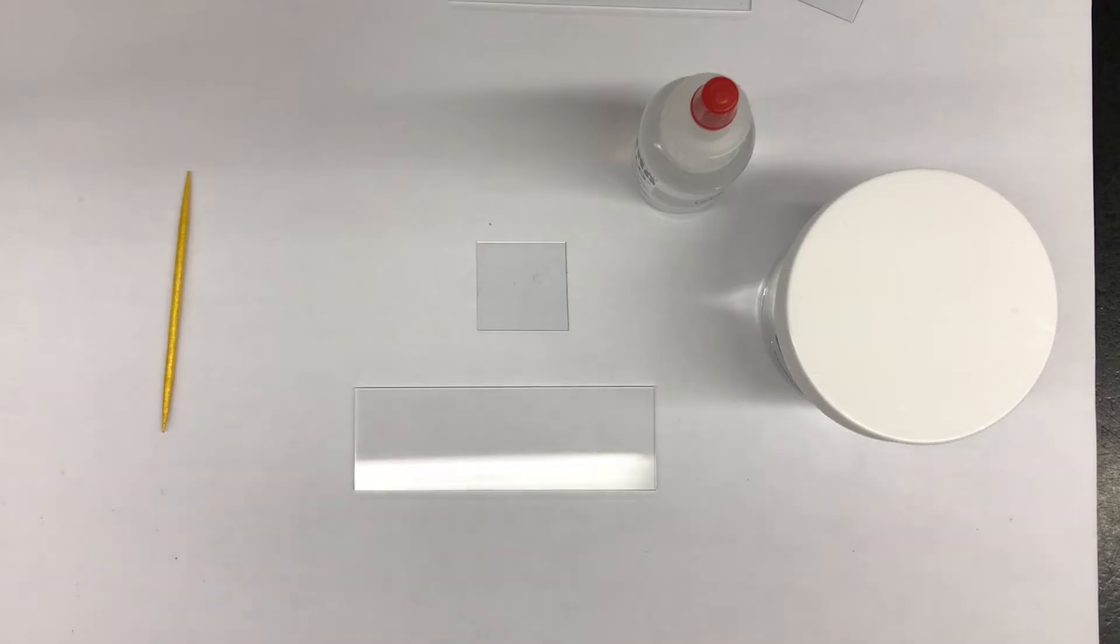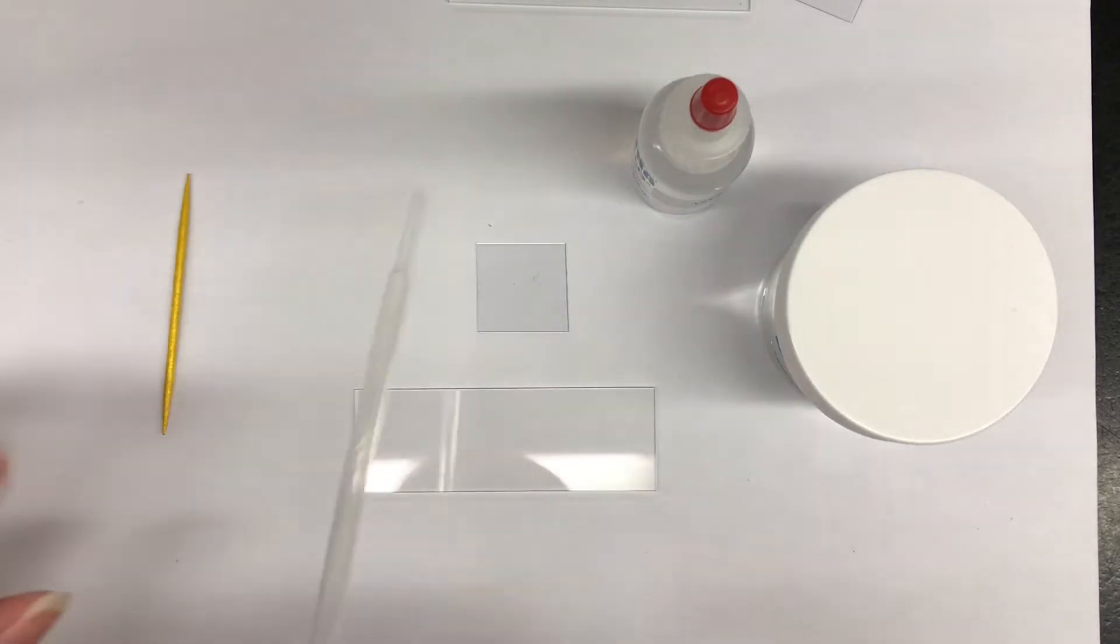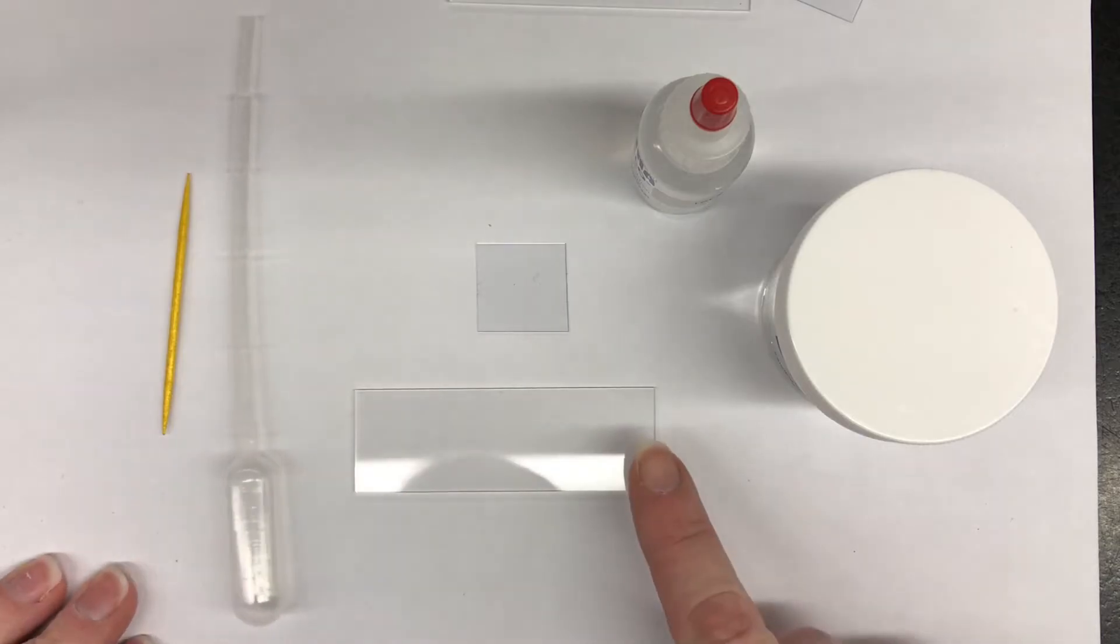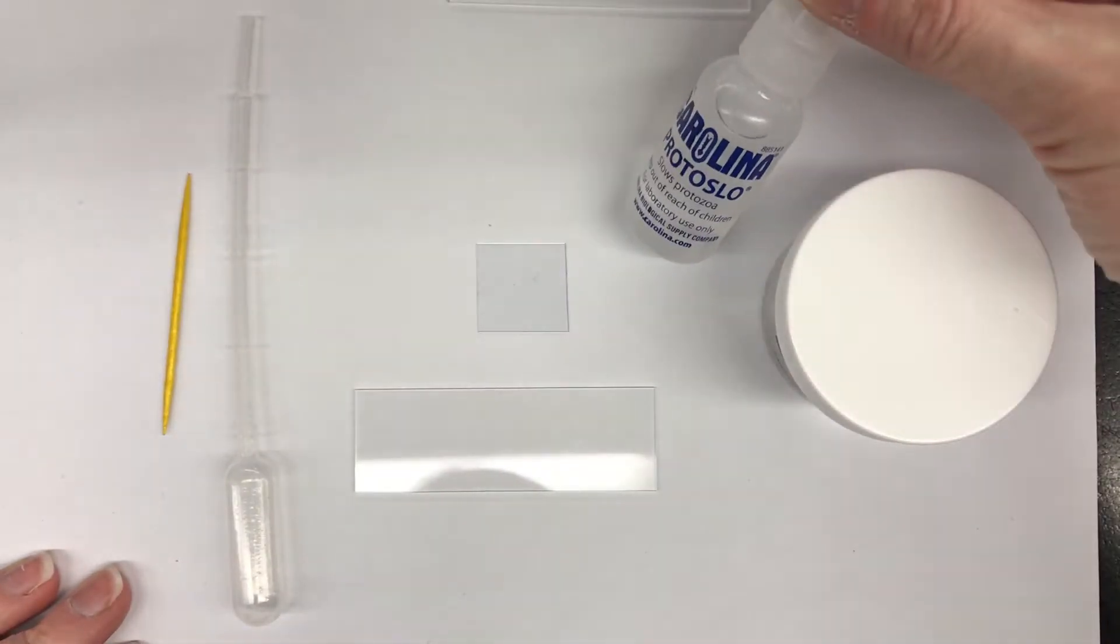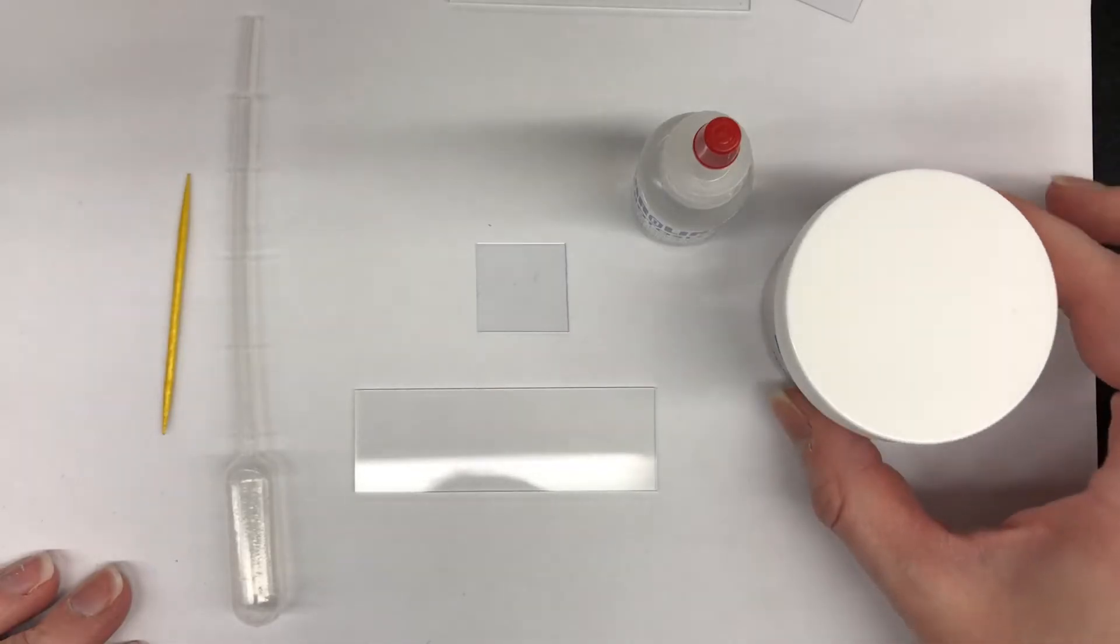When making your wet mount slide, you want to start with a toothpick, a plastic pipette, a glass slide, a cover slip, your protosloe, and your specimen sample.